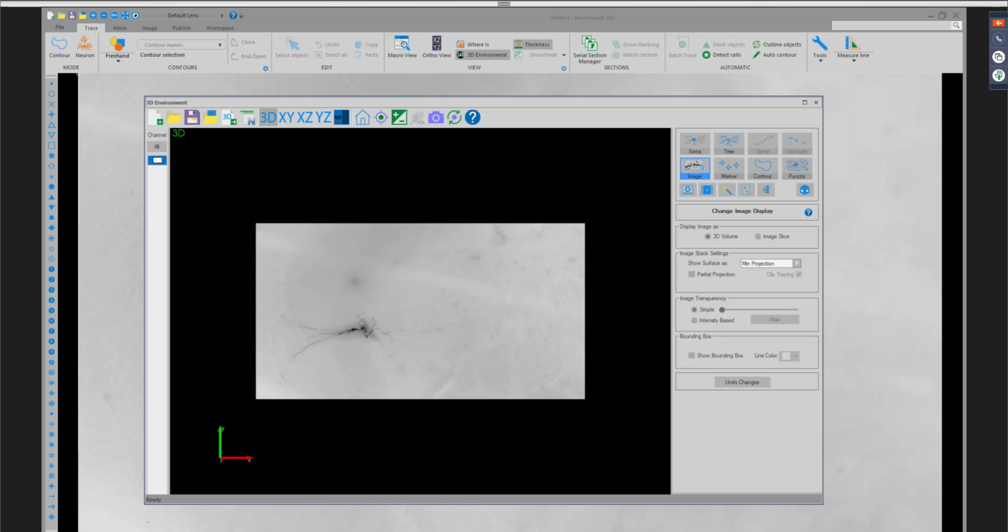On the screen now, you should be able to see a nice large image. This is actually an image that we've used in the past to demonstrate our large volume reconstruction mode. What's nice about this is that we no longer have that mode. We've replaced it with our Subvolume tool. The first thing that I want to get across is that this Subvolume tool is not just for the Neurolucida 360 Studio users. This is for anybody that has Neurolucida 360. That's a major difference between the old large volume reconstruction mode and this new Subvolume tool. So this is applicable to anybody who has large data or very dense data and anywhere in between. We can really use this tool to dig into the research that you're looking to do.